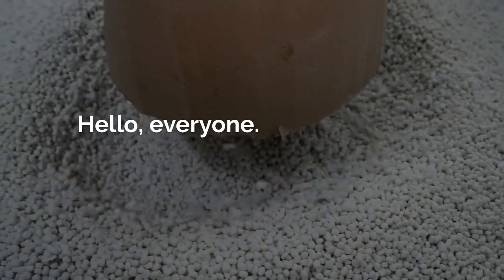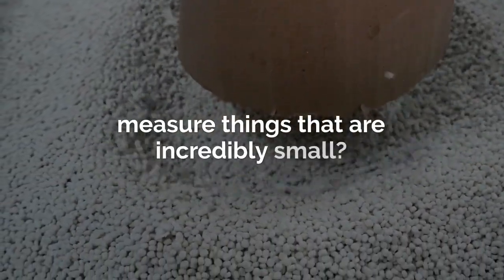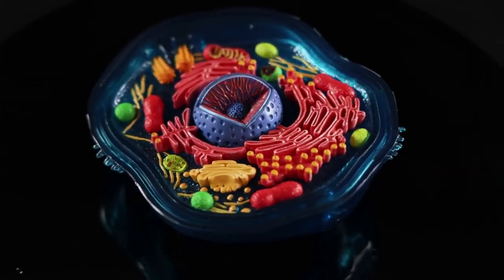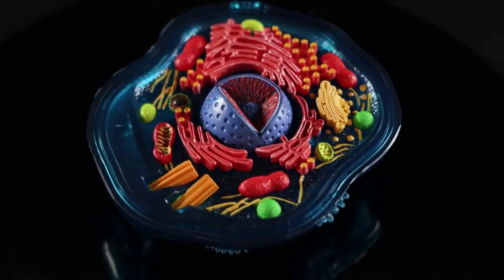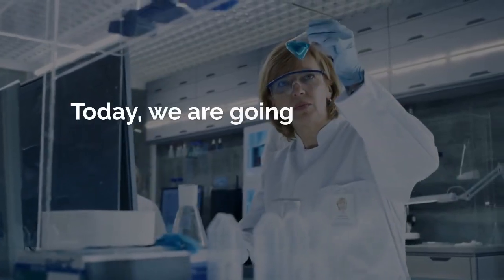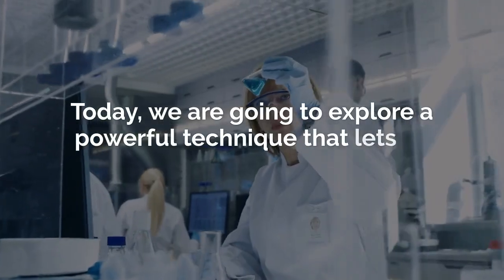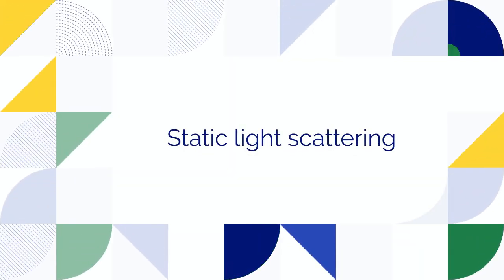Hello everyone! Have you ever wondered how scientists measure things that are incredibly small? I'm talking about nanoparticles, polymers, or even proteins in a solution, things far too tiny to see with a standard microscope. Today, we are going to explore a powerful technique that lets us do just that. We're talking about static light scattering.